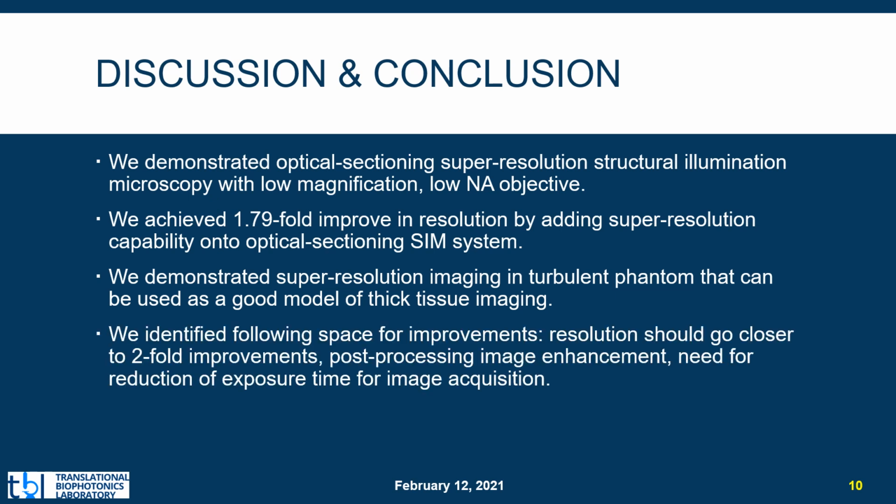Finally, we identify the following areas for improvement. Resolution should go closer to 2-fold improvement, post-processing image enhancement, and a need for reduction of exposure time for image acquisition.